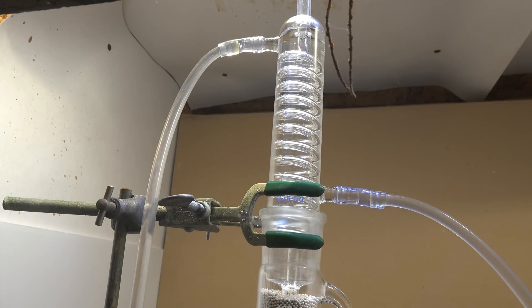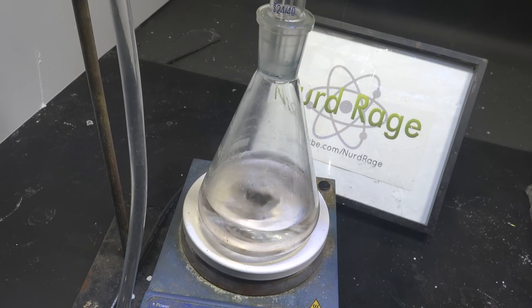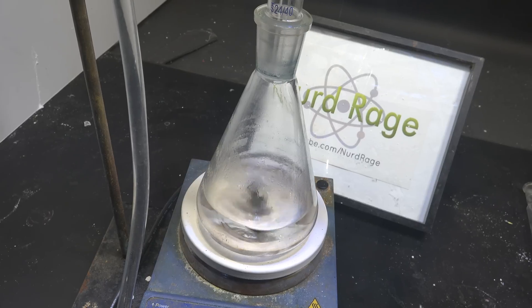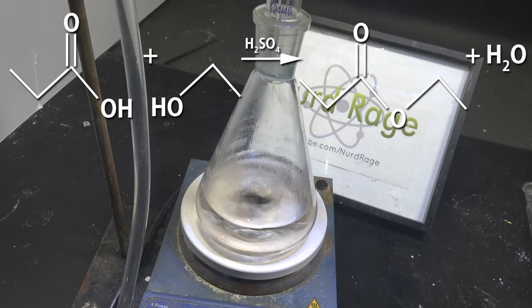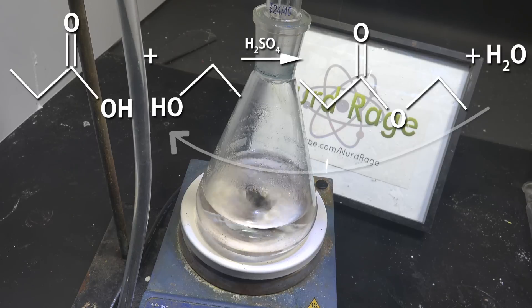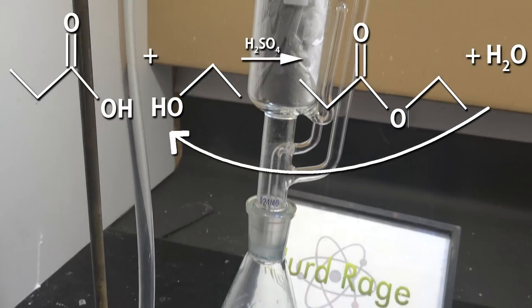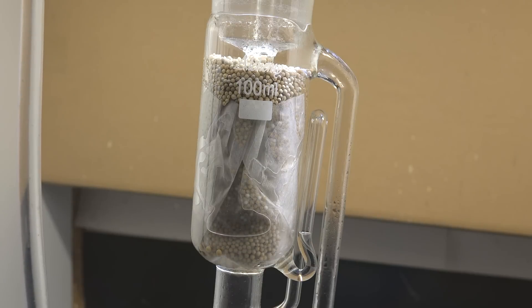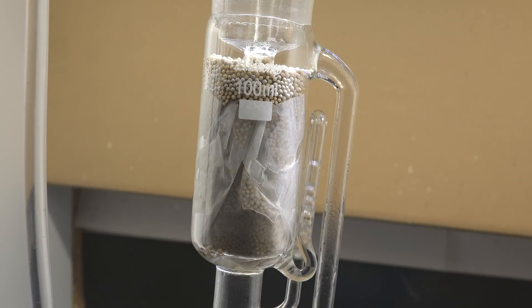Once the apparatus is assembled and cooling water is running, turn on the hot plate. Gradually raise the temperature until it starts to reflux and condense into the Soxhlet extractor — you don't need a very high turnover rate. What's happening is we're reacting propionic acid with ethanol to form ethyl propionate and water; the sulfuric acid acts as a catalyst. The reaction is reversible, so we can never get a good yield at equilibrium alone — water reacts with ethyl propionate and reverts to ethanol and propionic acid. The Soxhlet extractor helps us get around this. The boiling mixture of ethanol, propionic acid, ethyl propionate, and water forms low-boiling azeotropes that rise up and condense into the Soxhlet apparatus.